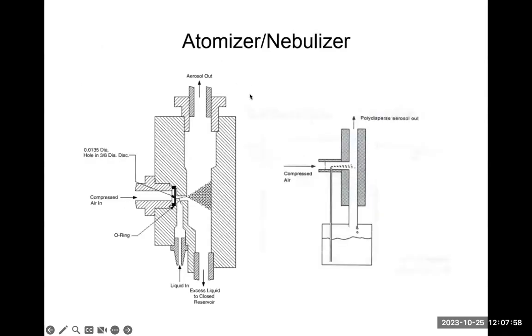So first about the atomizers, nebulizers. The atomizers or nebulizers, based on how you call them, basically just convert, let's say, a liquid solution into droplets. And further, you can dry these droplets to remove the solvent in the droplet and then get the dried material. For example, you can use sodium chloride water solution, and then it will first generate these salt droplets, and then you can dry these droplets and further generate these dried sodium chloride particles. But how do we generate these droplets?